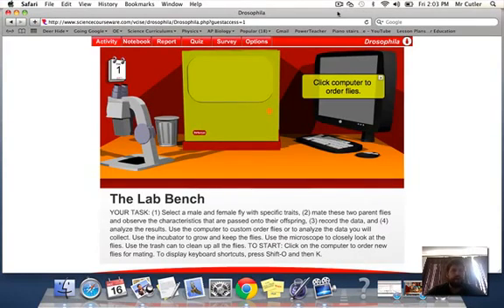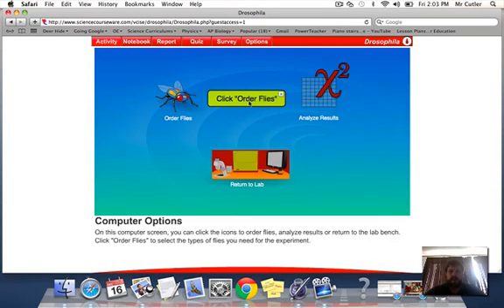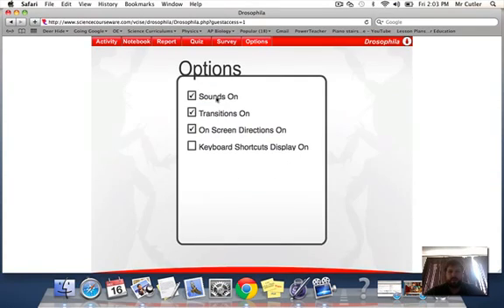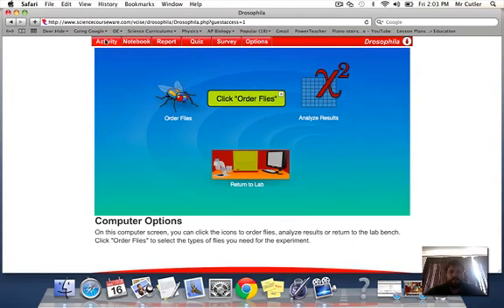We're at the dihybrid cross now for the Drosophila Lab. First thing to do is go and order your flies. Actually, once again, I'll turn off the sounds and the transitions. Go and order your flies.